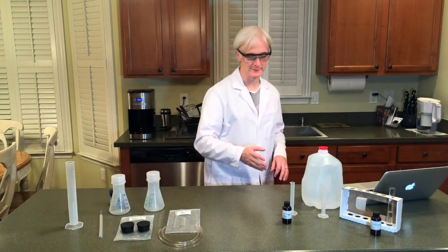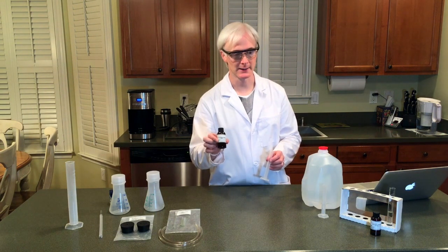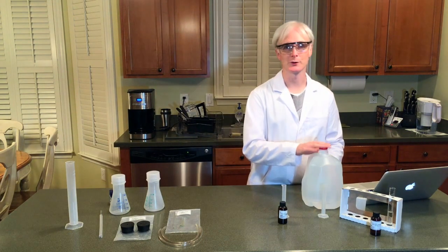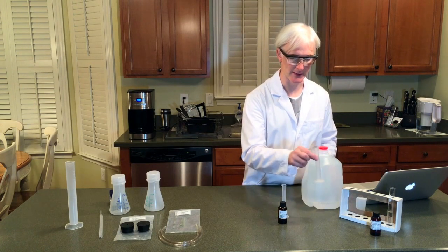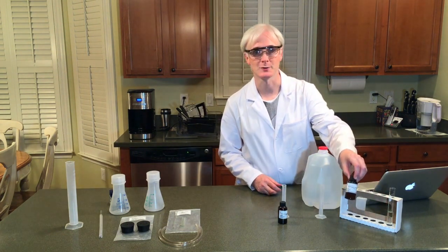Over here we have our reactants. First off, we have iodine potassium iodide, IKI, and a graduated cylinder that we're going to use that with. We also have distilled water — you're going to have to get the distilled water yourself, as it's obviously not supplied in the container. And over here we've got 3% hydrogen peroxide.